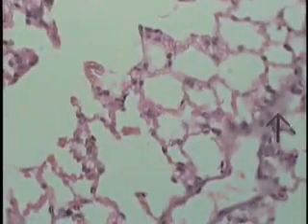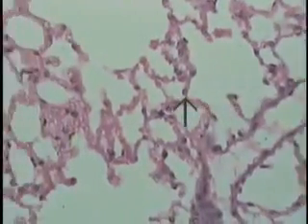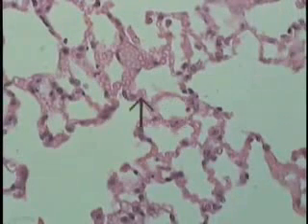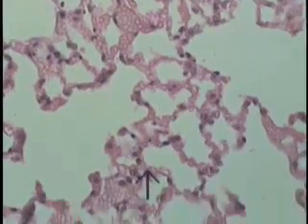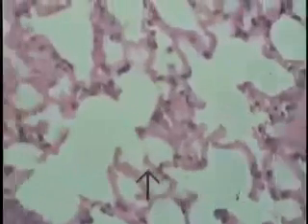Here is a group of alveoli as seen in cross-section. One is shown here, another here. All this lacy type of tissue with the lumen inside, its surrounding, are alveoli, but alveoli that have been cut at different angles. Again, another field showing you the mass of erythrocytes, and if one traces those, that is what's really outlining and making the alveolar wall visible in many of these tissues, particularly the individual alveoli.